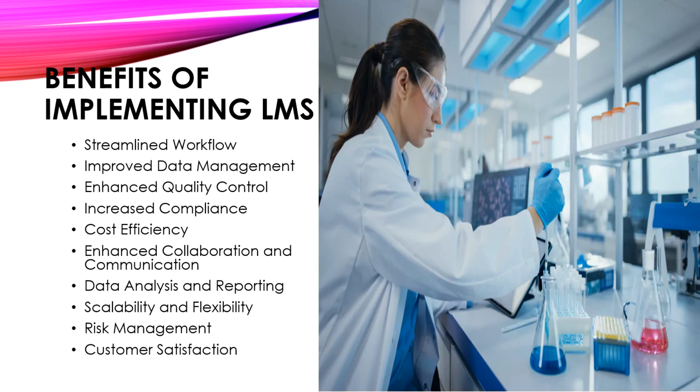Increased compliance. A laboratory management system provides tools for tracking regulatory requirements and standard operating procedures (SOPs), ensuring that laboratories adhere to industry standards and compliance regulations such as ISO, CLIA, FDA, and GLP. Now, this reduces the risk of non-compliance penalties and regulatory issues.